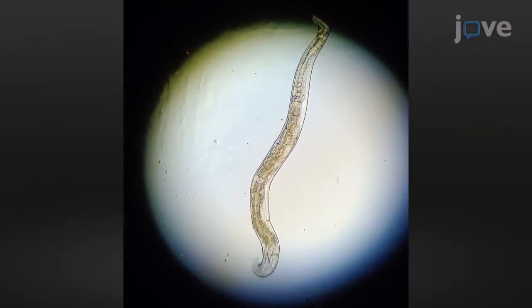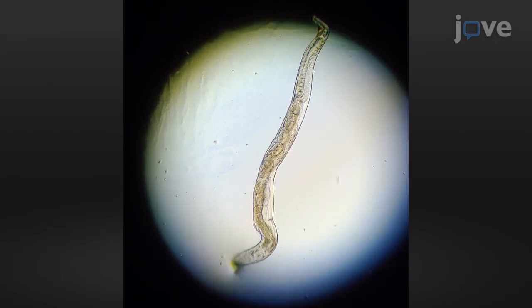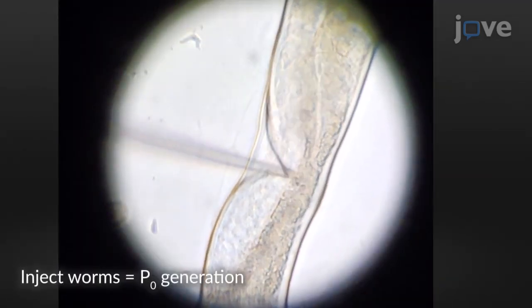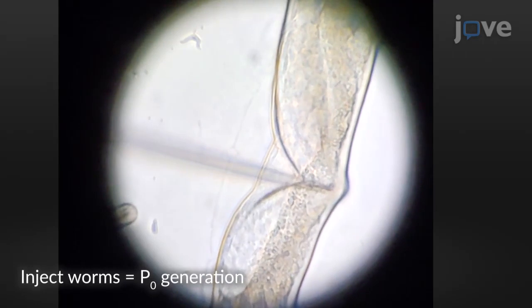Next, use a dissecting microscope to pick about 30 young adult worms with fewer than 10 embryos in the uterus, and inject both gonad arms of each worm with a few picoliters of injection mix per arm.